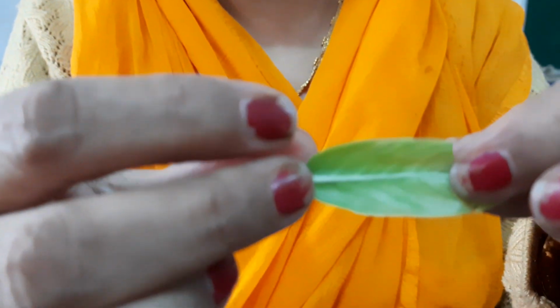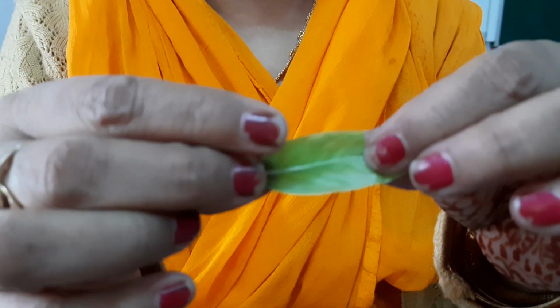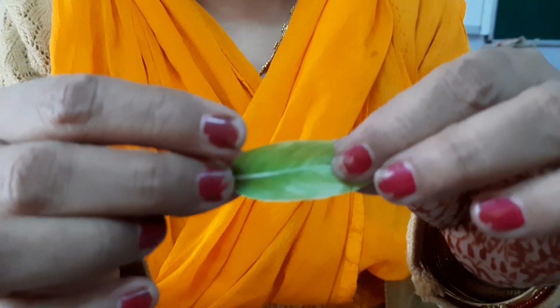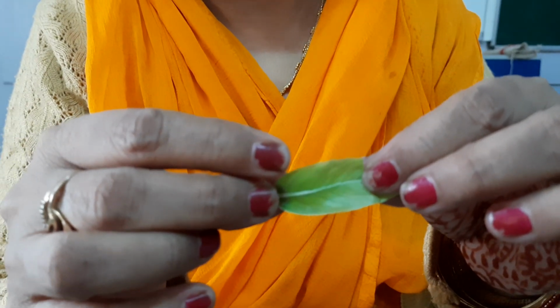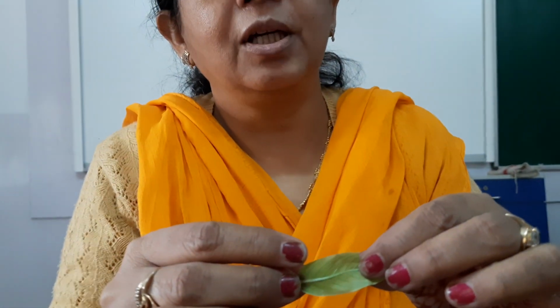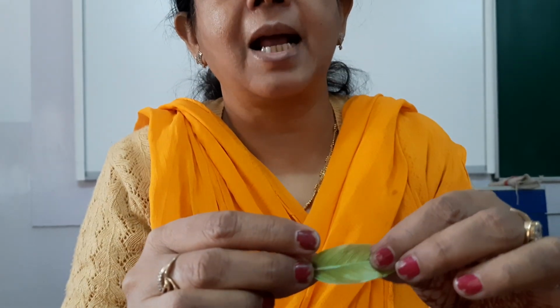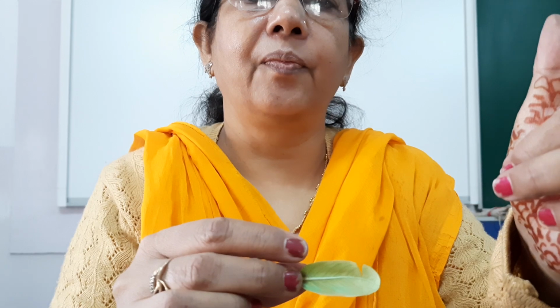dorsal surface. So we can conclude that from the lower leaf surface of the dicot leaf, the stomata, which are more in number, lose more water. So it demonstrates unequal transpiration from both the leaf surfaces of a dicot leaf, right?